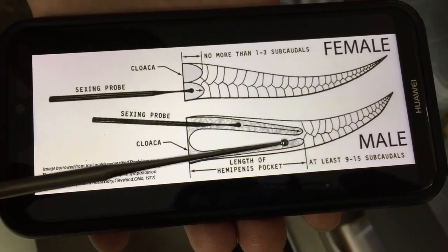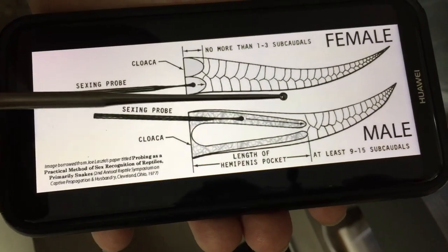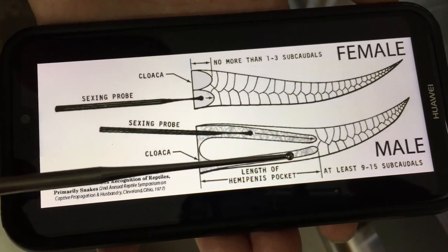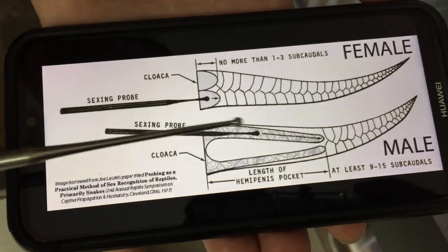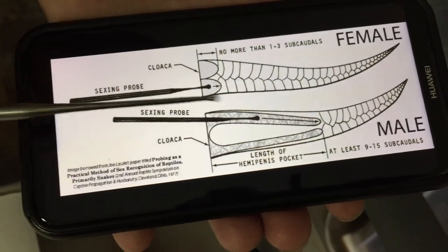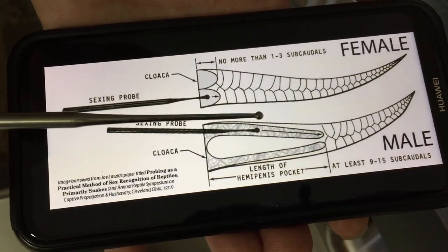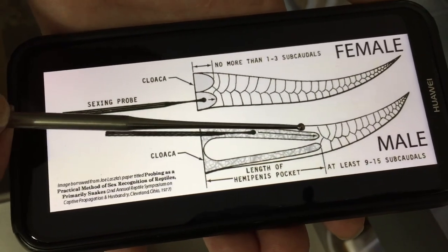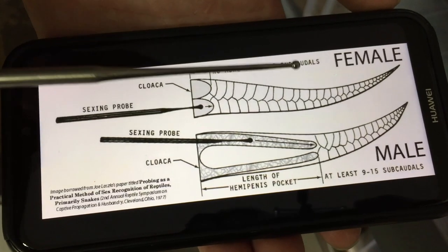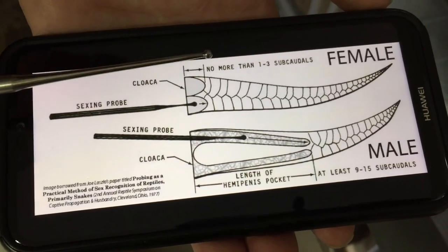With males, they have two hemipenes lying in two pockets. That's what we try to find in the snake to prove it's a male. When we insert the probe it will go much further than with females because it goes into the pocket where the hemipene lies. Generally with males it will go nine to fifteen subcordial scales deep.